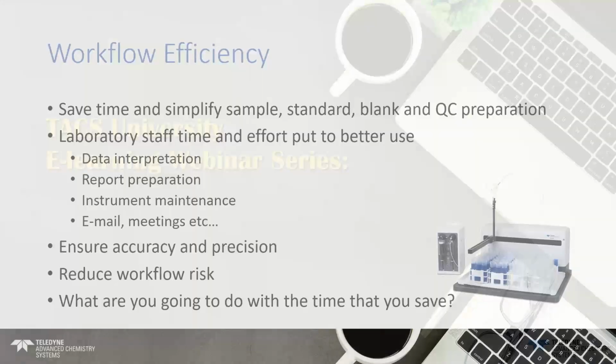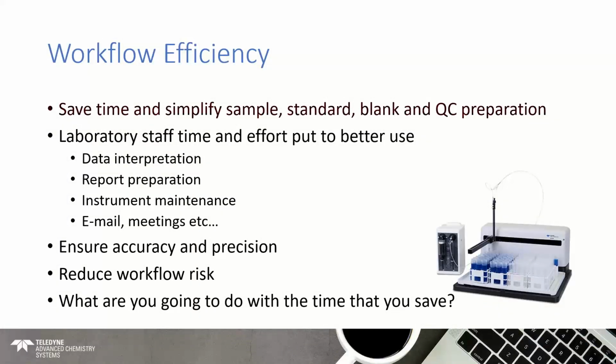Now workflow efficiencies. I'll just whiz through this. Obviously, there is time and effort that can be saved by going to an automated workflow for preparing samples, calibration standards, blanks and QCs, etc. Laboratory staff time and effort can certainly be put to better use.